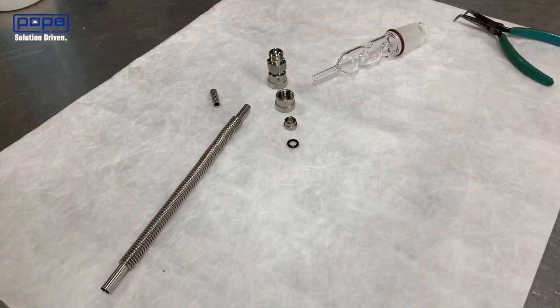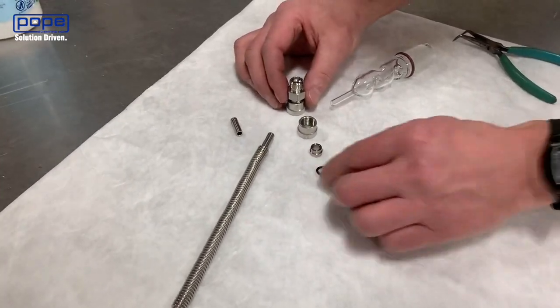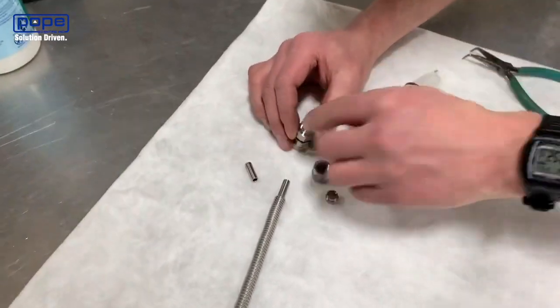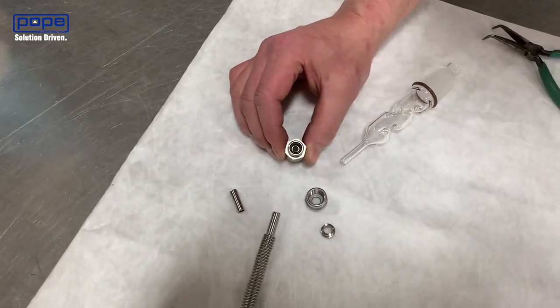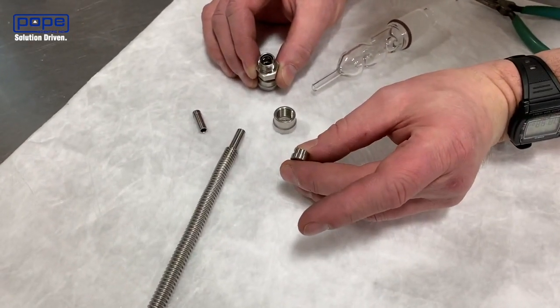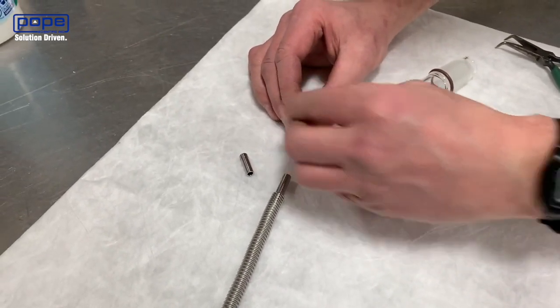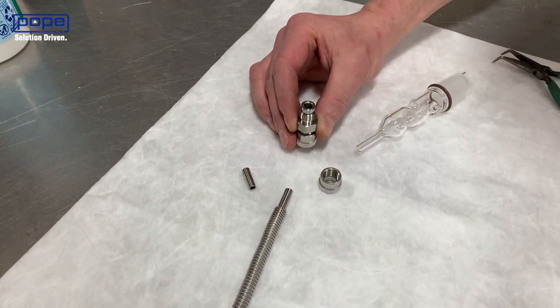Now we're going to practice putting the Ultra Torre fitting back together. The first piece is the o-ring, which always goes on the inside of the fitting. Next we're going to put in the ferrule. The ferrule has a fat end and a thinner end — the thinner end goes inwards towards the fitting, and the fat end goes outwards towards the other pieces.